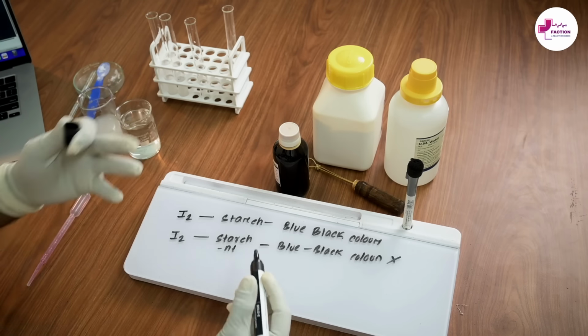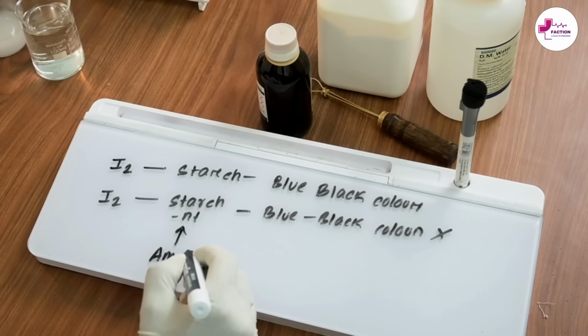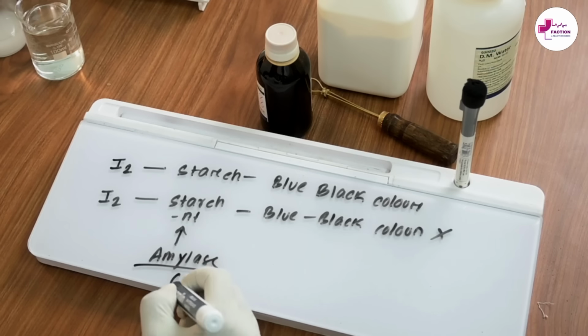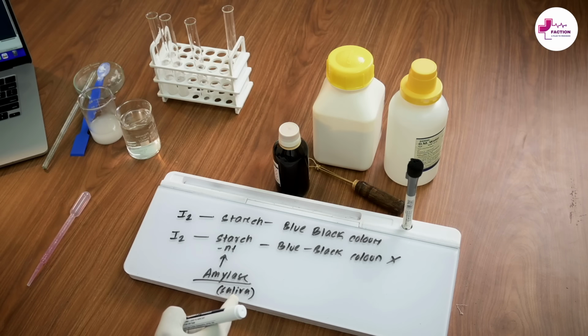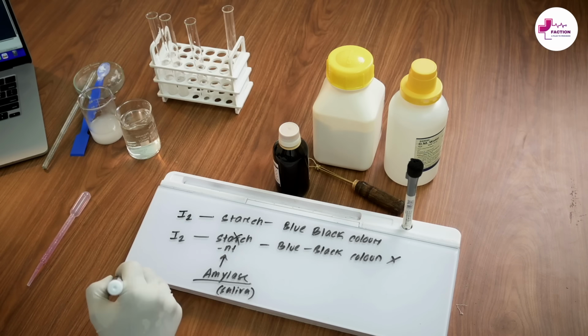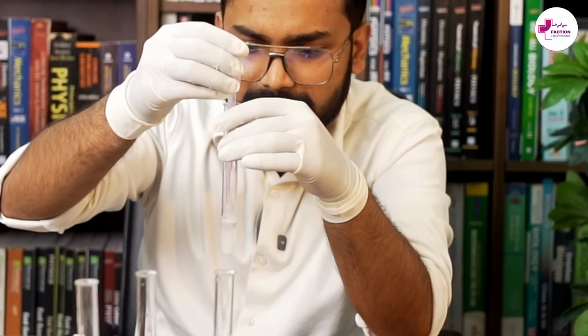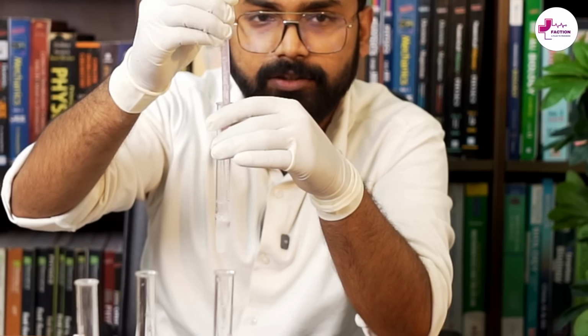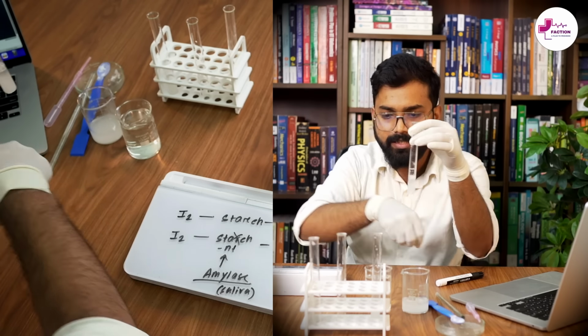when I say starch is absent, that means I have to give here a starch digesting enzyme, that is amylase, which is seen in our saliva. Now when we give saliva on starch, starch is digested, so blue black color is not formed. Now I am giving amylase, that is saliva, into one of the test tubes and the other test tube we will put it free.